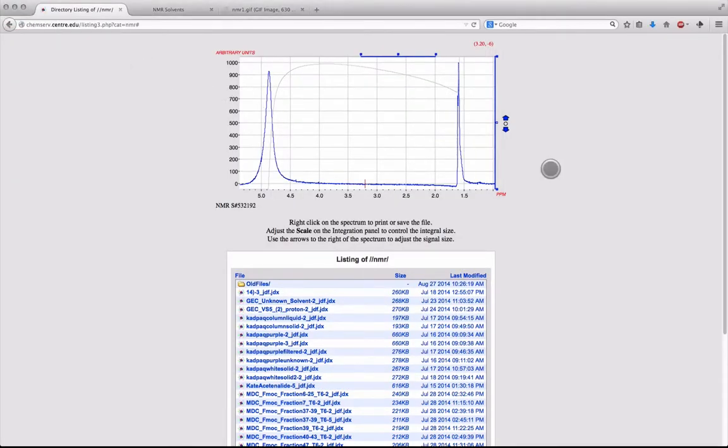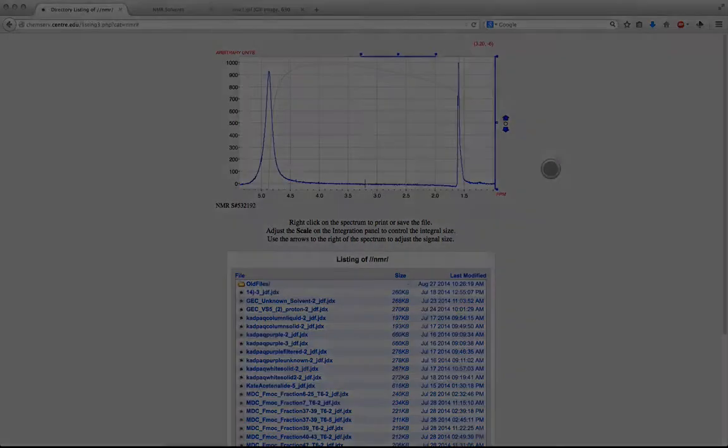That's it for this tutorial. I hope this video has helped you learn how to use the ChemServe website, and I hope it will help you with your upcoming experiments.